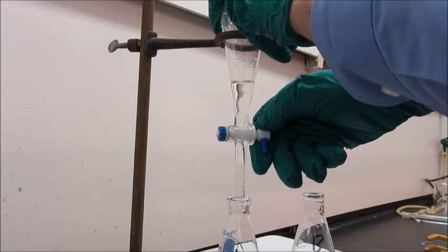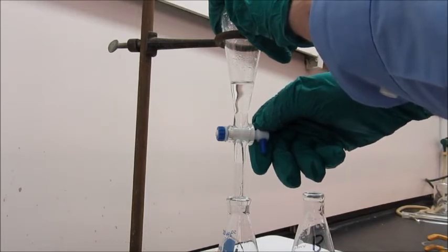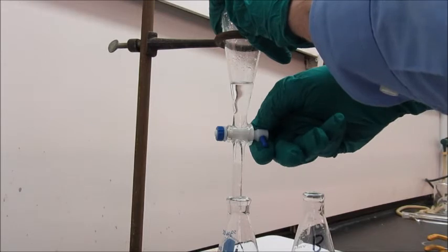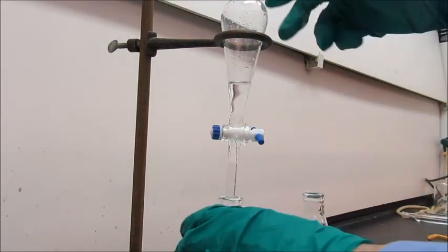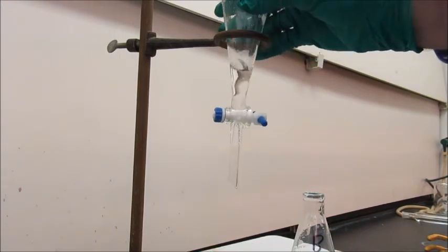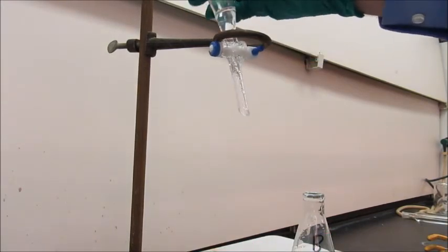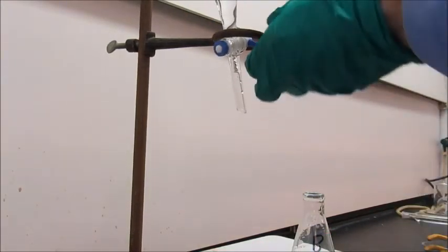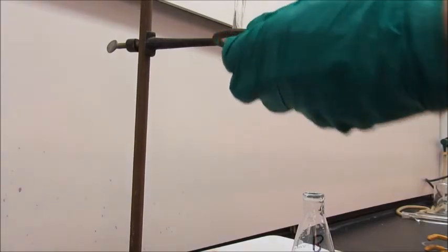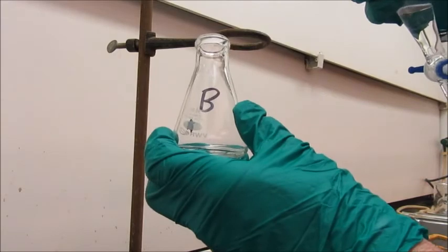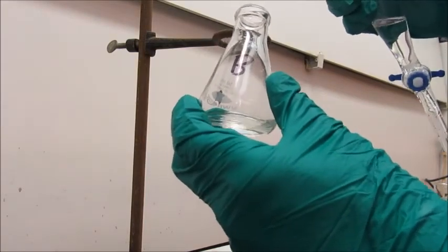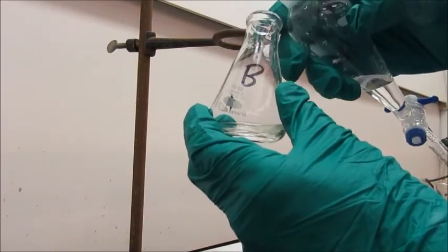So I'm slowing down to a drip now. And now we're there. So again, we'll take out the top layer. And I'm going to pour it out the top and into flask B, which has the top layer from the earlier separation.